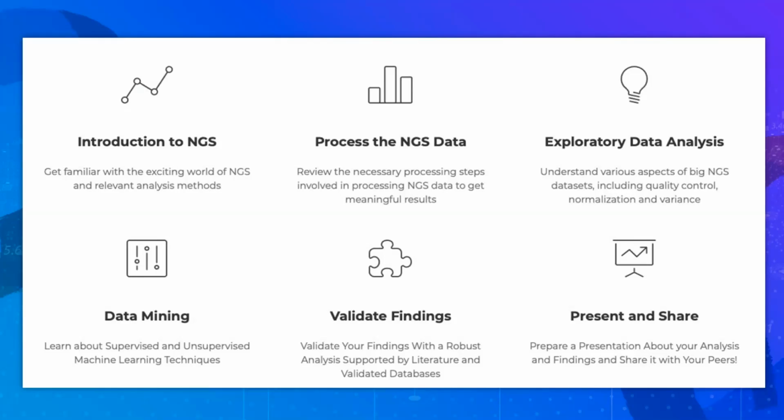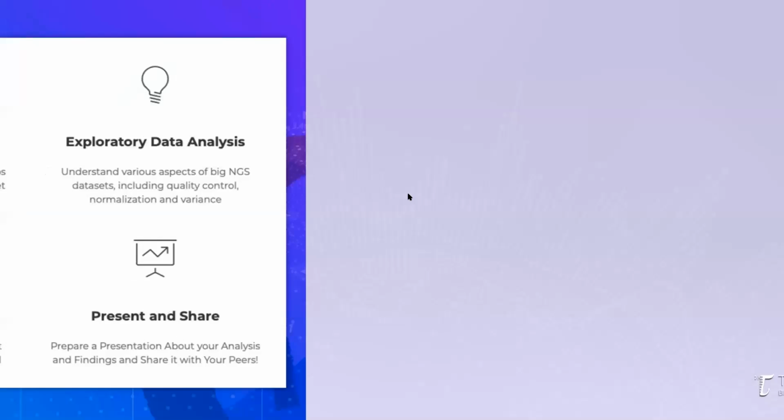So in this program, we will provide both theoretical and practical training for those who are interested in next-generation sequencing that is becoming widely accessible and helps us study a variety of different biomedical and other types of biological topics. In each program, you will learn about the type of data, how to process it and prepare it for analysis, and utilize data science skills to mine and visualize large data sets and present your research to peers and experts for feedback.